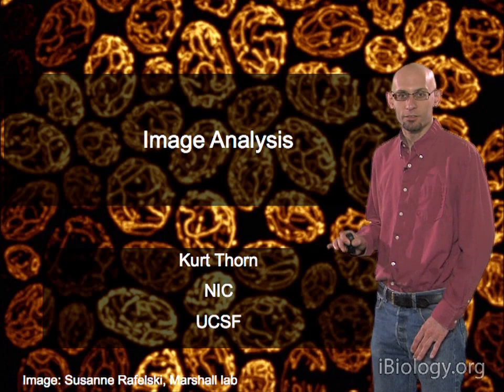Here's an image of a cell. There's actually one bright cell here and a dim cell over there and another dim cell over here. If we plot the pixel intensity histogram of this image, we're plotting on the y-axis the number of pixels with a given intensity, and on the x-axis that intensity. You can see the intensity goes up to about 10 or 20,000, or I guess 30,000. This image is mostly background, mostly this dark background, and so the histogram is dominated by this huge peak, which represents all the background pixels. Then the cells are this tail on the histogram and this little bump right down here.